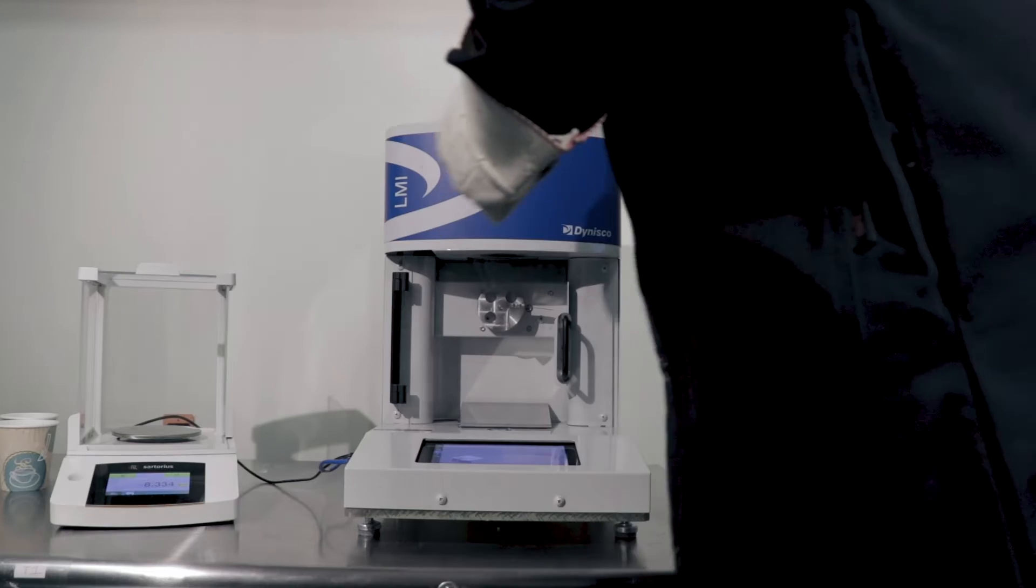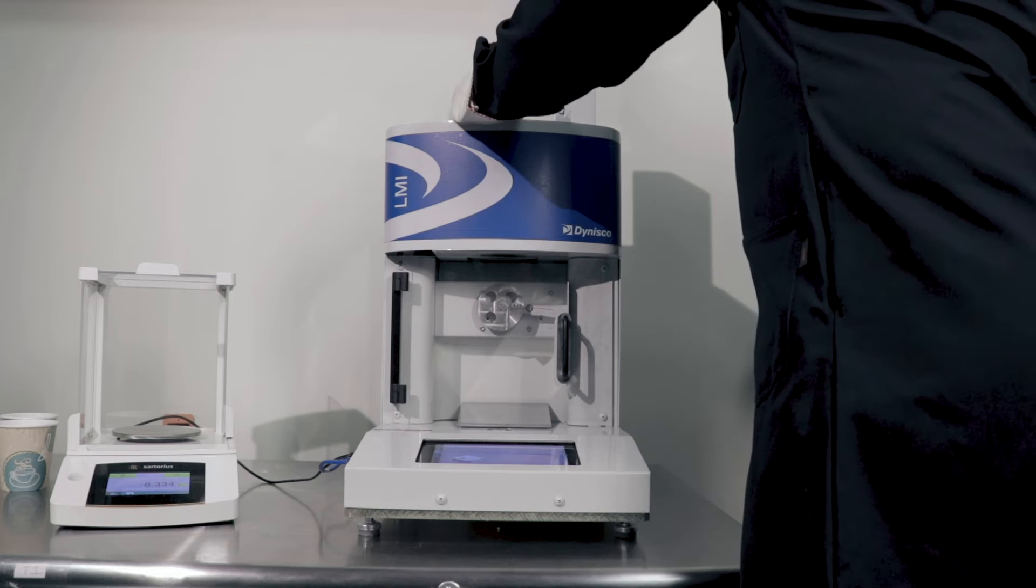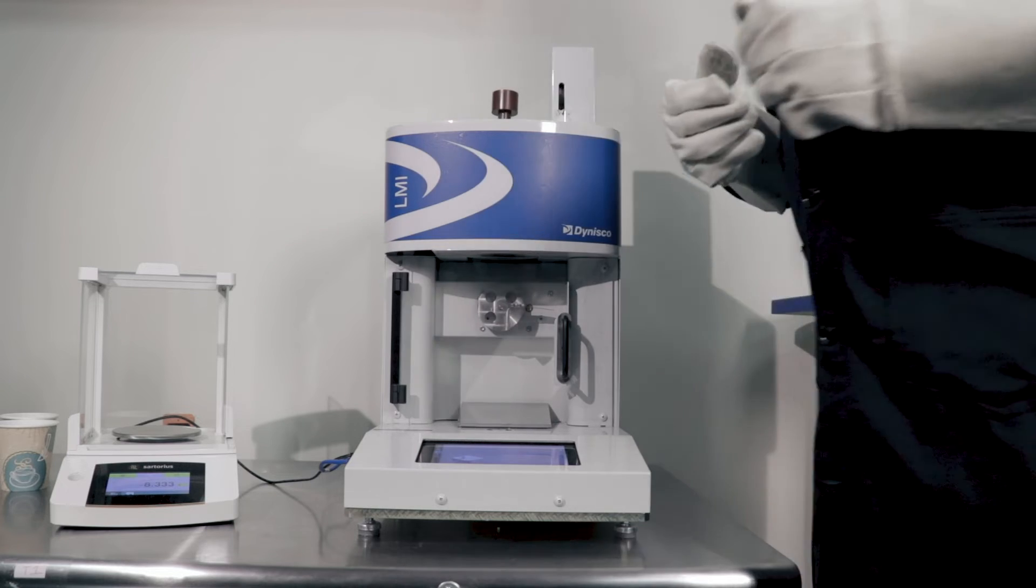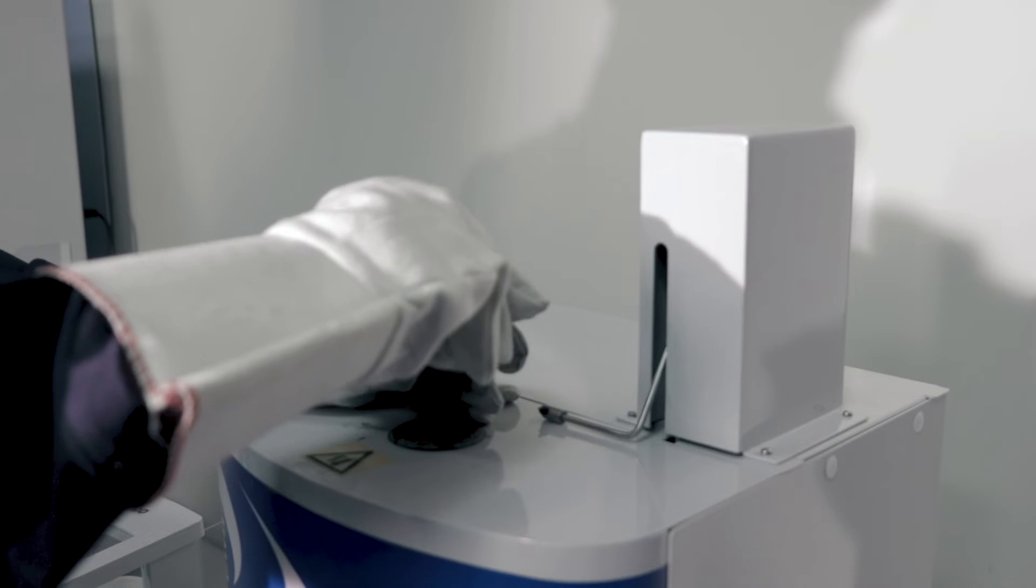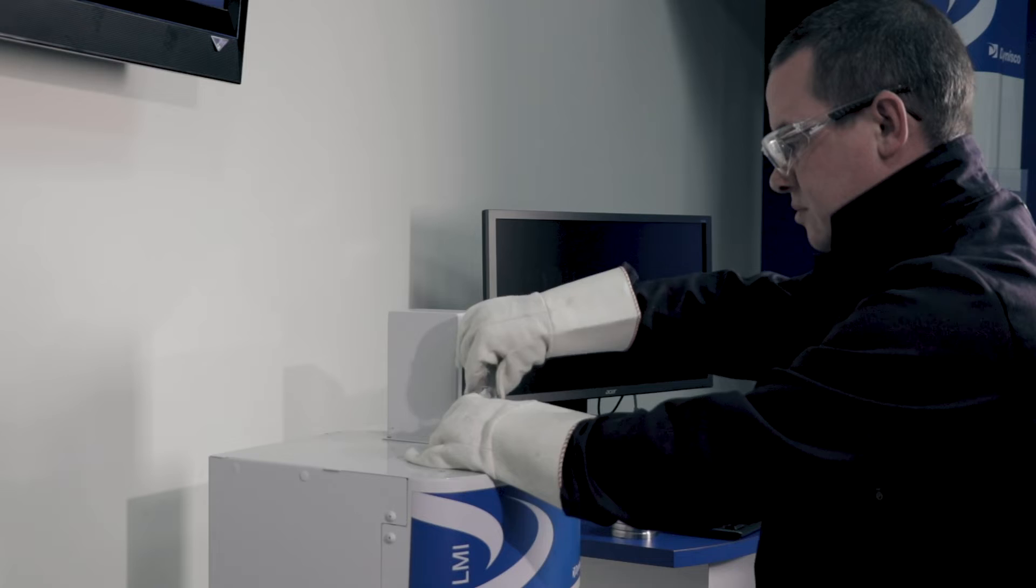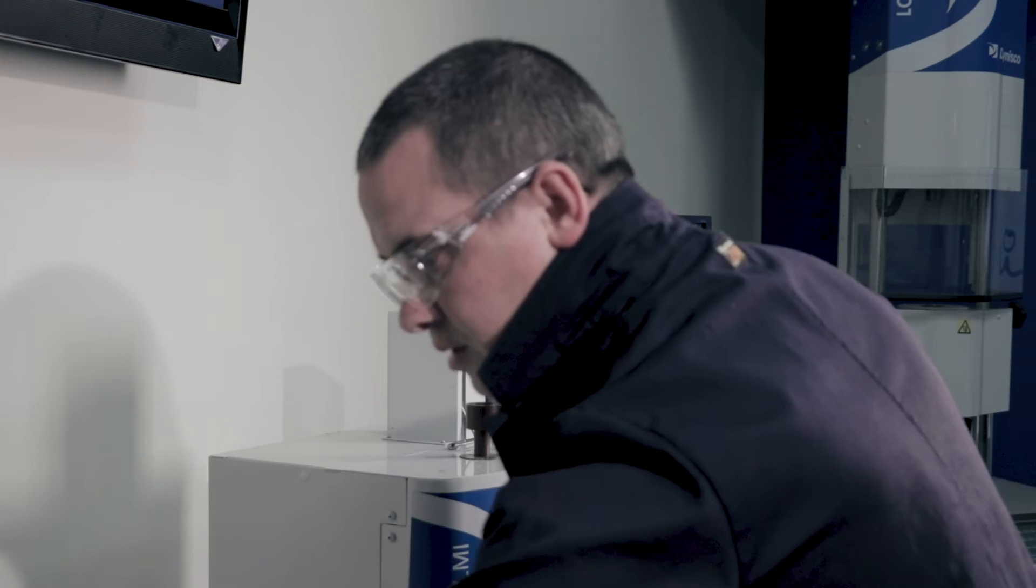Next, 5 grams of polymer is manually packed into the barrel of the LMI 5500. The operator will use the fill funnel that is included in the toolkit to aid in filling the barrel chamber. A manual packing device is used to compact the charge of material in the barrel.